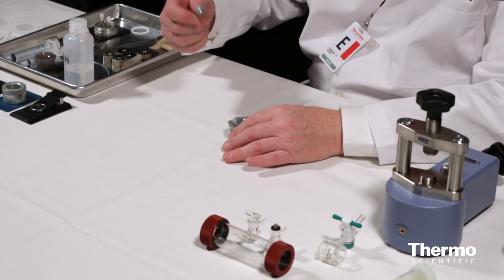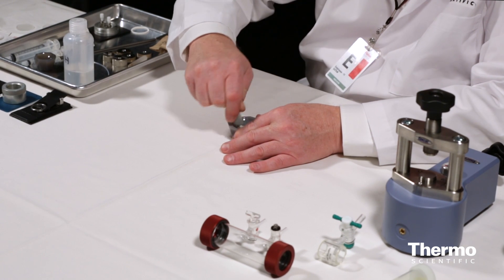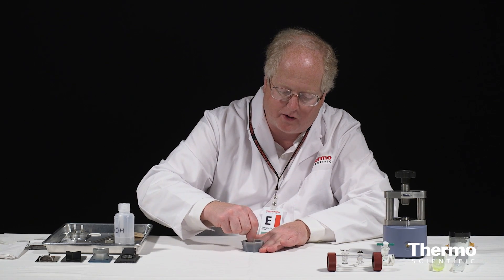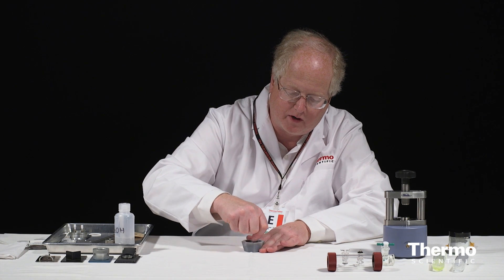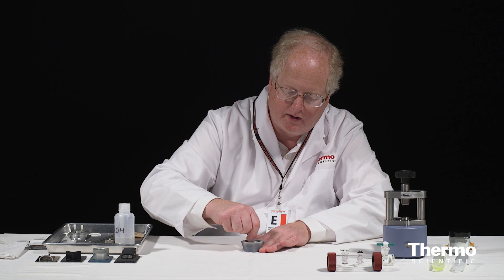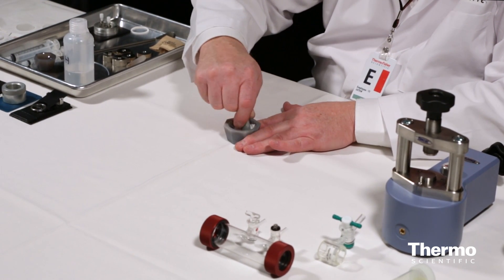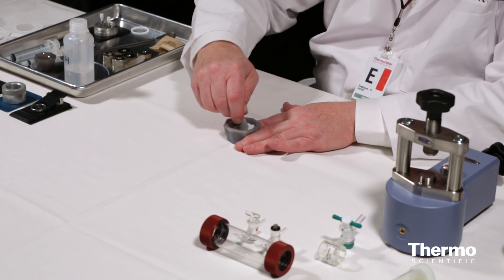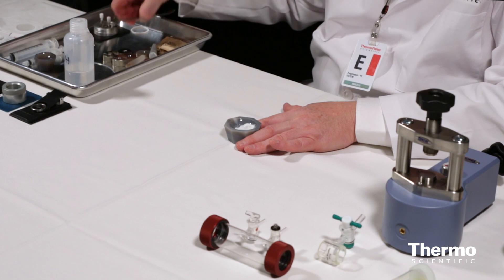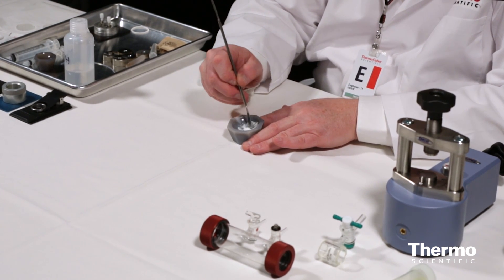Then I'm going to take my mortar and pestle and just grind it all up like this until I have just a fine powder. That's what I'm looking for — a fine powder. This has two results: first, it blends the sample so that we get a consistent, homogeneous pellet when we make it. And it brings the particle size down smaller so that when we go to make our pellet, we're good.